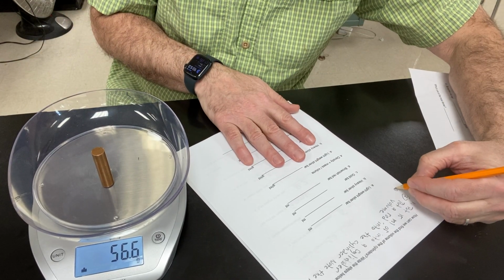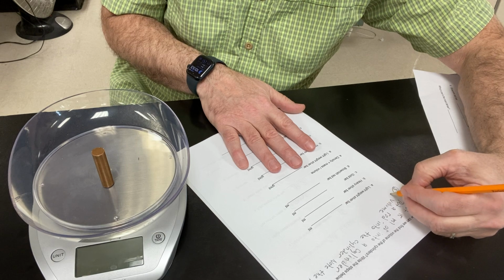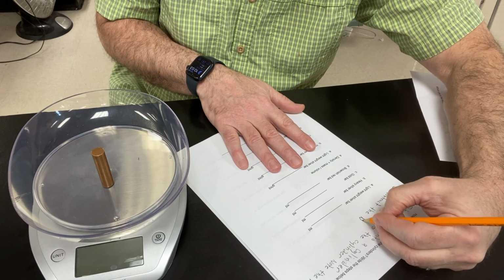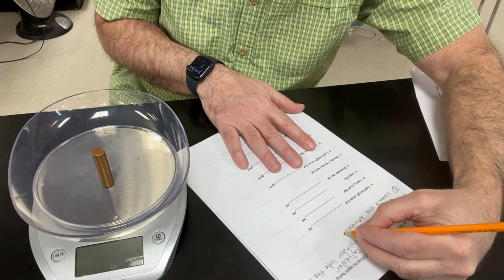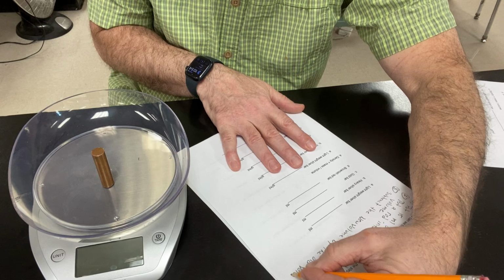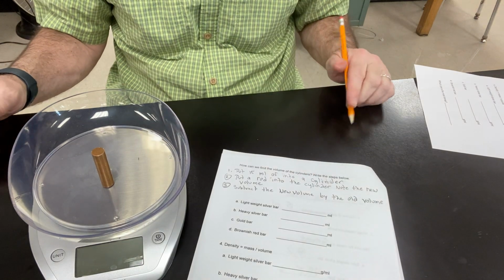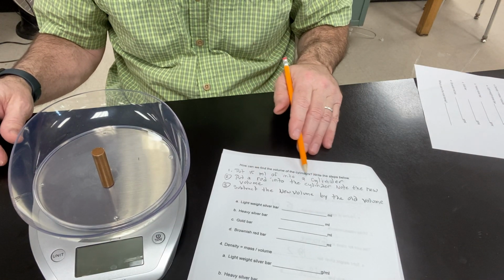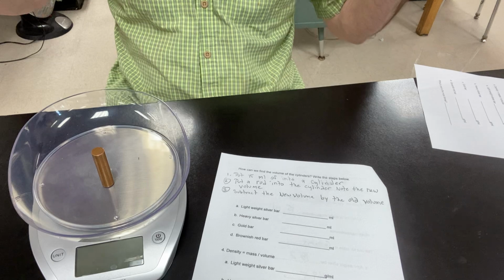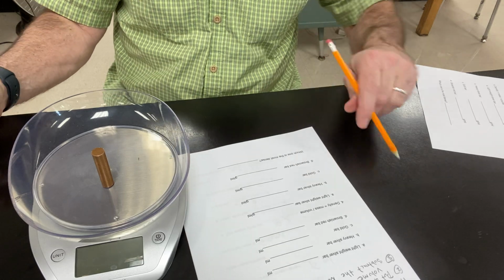Number 3, subtract the new volume by the old volume. Okay? Not super difficult. We should be able to write down the procedures. I only have 3 steps. Number 1, put 15 milliliters of water into a cylinder. 2, put a rod into the cylinder and note the new volume. Number 3, subtract the new volume by the old volume, and that gives you the volume of the rod. Okay. So next, we have to do that to each of these.